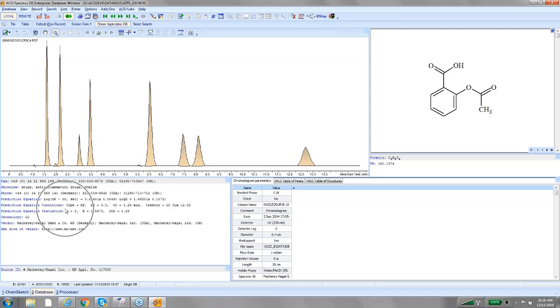Over here, you can add a whole bunch of what we call metadata, which could be compound ID, ELN number, chemist name, SOP number. Anything that you want to search on that you've added here is fully searchable.